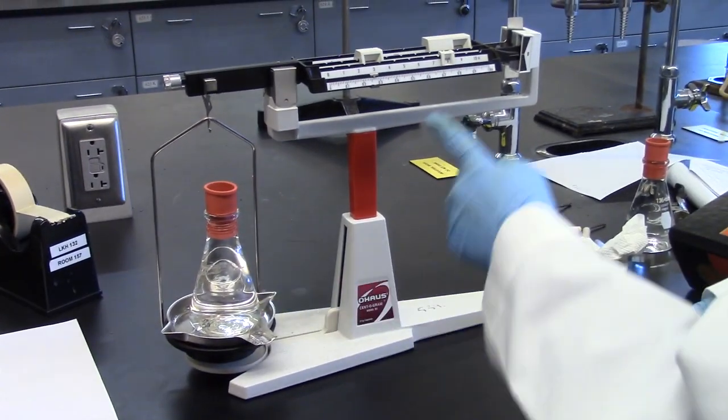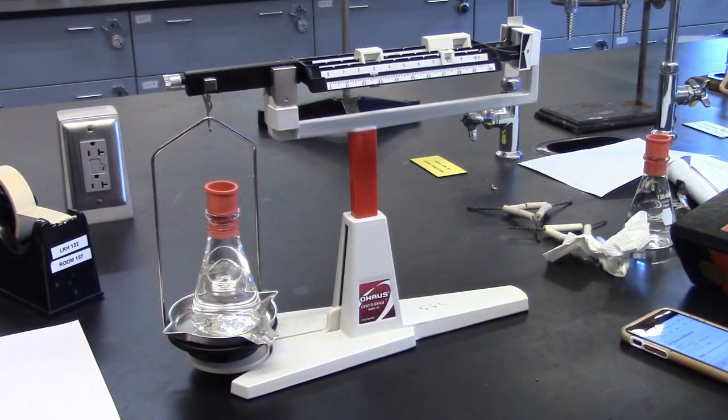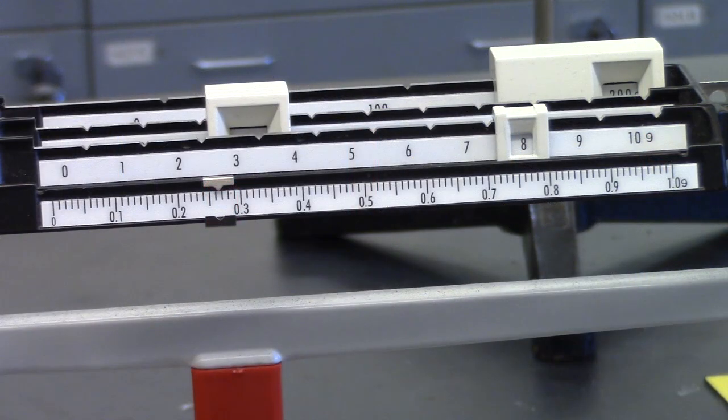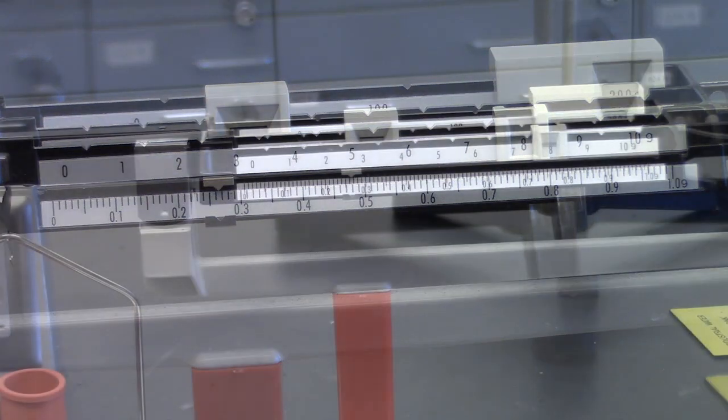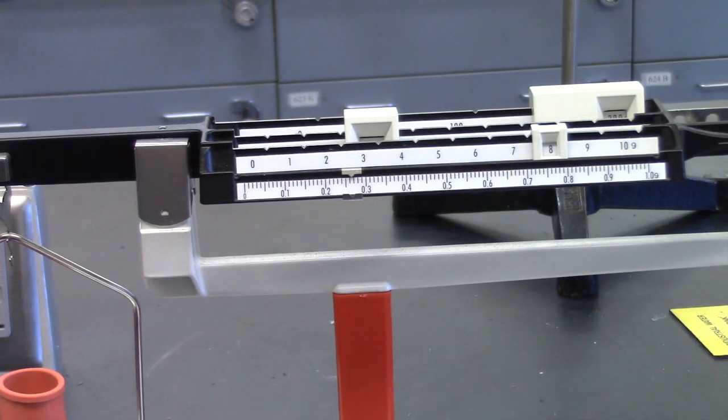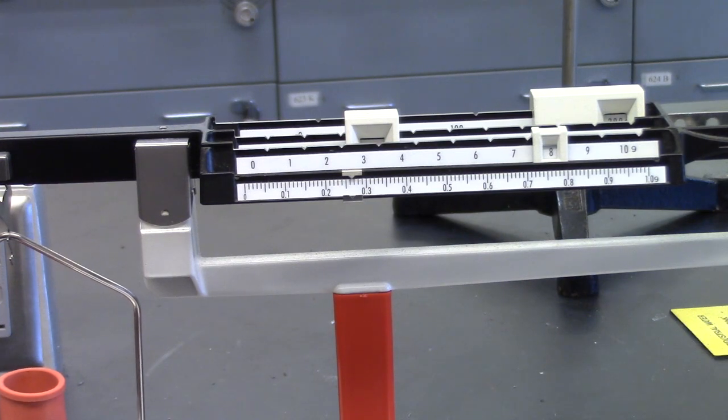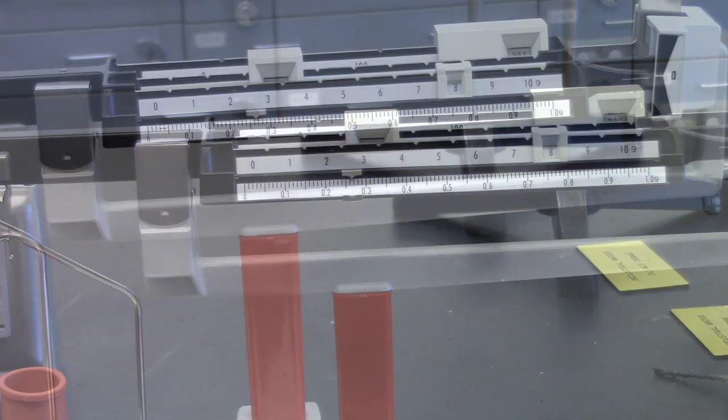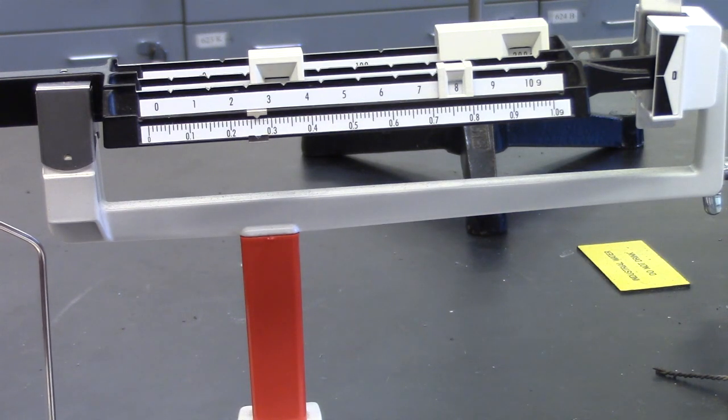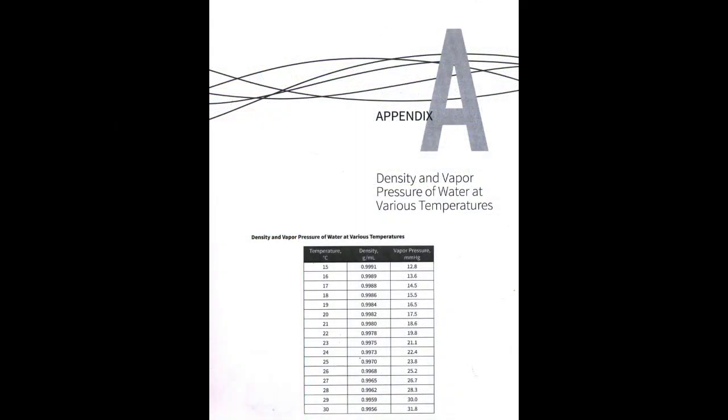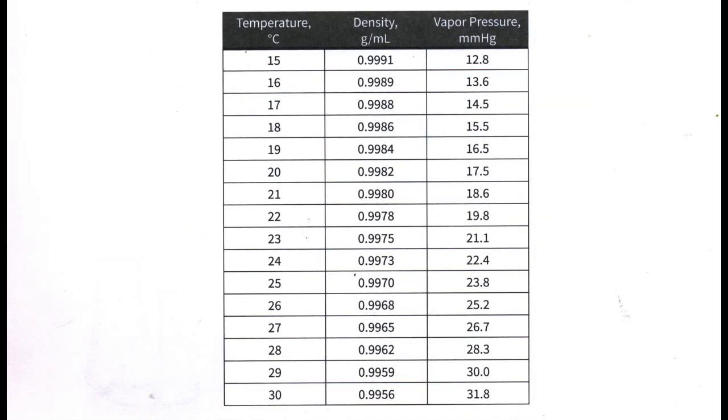Weigh the flask, septum, and water on a properly zeroed triple beam balance. For example, this weighs 238.26 grams. You cannot use an analytical balance for this step because the mass will exceed the capacity of the balance and may damage it. Record the mass of the apparatus plus water and the temperature of the water in your notebook. Find the density of water at this temperature from Appendix A in the back of the lab manual and calculate the volume the flask holds.